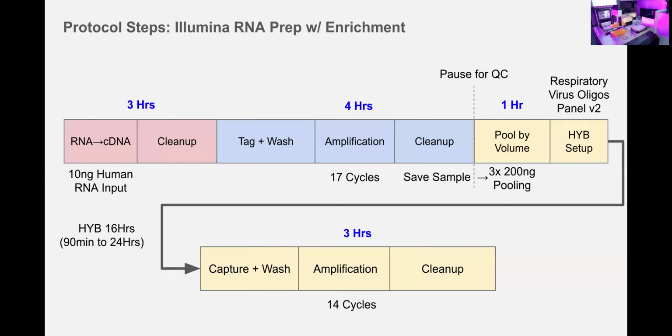I didn't want to tie up our robot doing a thermocycler incubation overnight, so I just had a pause to put that in an off-deck thermocycler. I also had a pause for the QC.